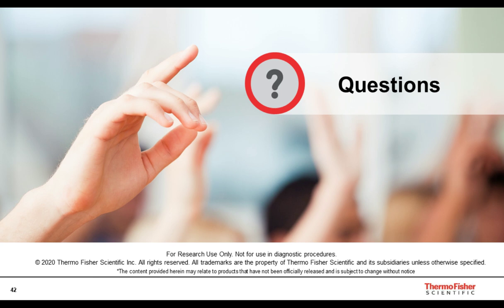Yes. So when we did the development and we're looking at the TrueTag system as well as a lot of those SNP experiments that I showed you with TALENs, we were doing sequencing to get the fraction of perfect HDR, HDR with error, indels. That was all sequencing data. And so for those SNPs, we were looking for basically the perfect repair of that SNP or those base insertions. And when we did our TrueTag product development, we also did sequencing of that to look for how well those junctions are occurring at the 5' or 3' end. And overall, the vast majority, we were seeing 85% or higher having perfect junctions, so them being integrated appropriately.